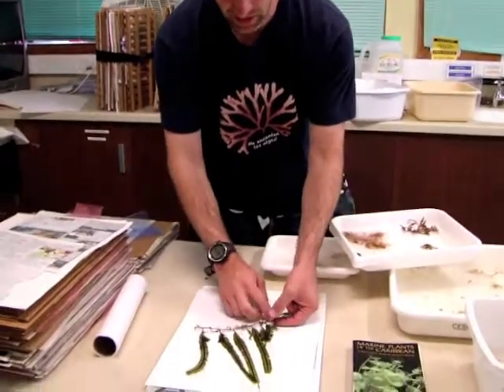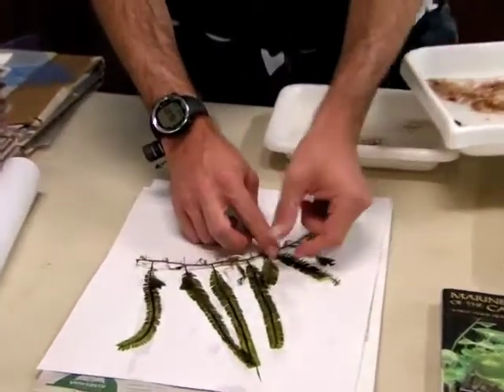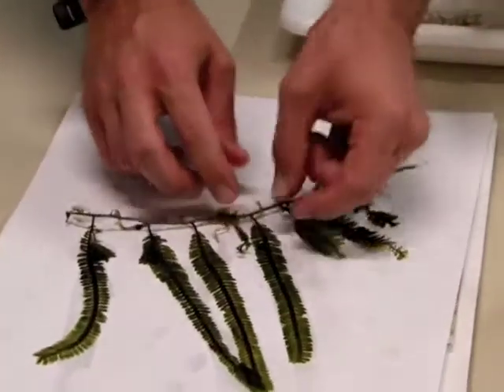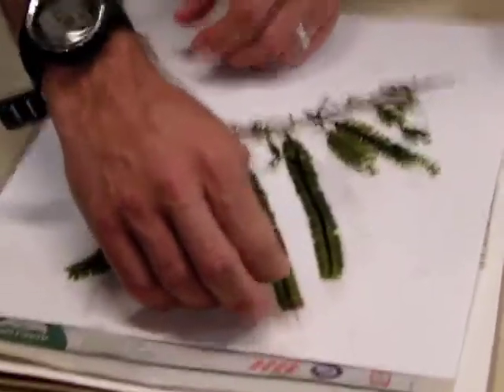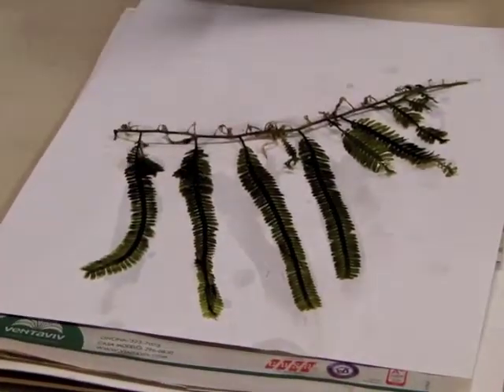One way that we can preserve algae is to dry them on paper in what we call a herbarium specimen. We take the algae out and put it on a piece of acid-free paper, and we can arrange them in patterns. It's very beautiful — it's sort of a form of art, and some people do it as a hobby.